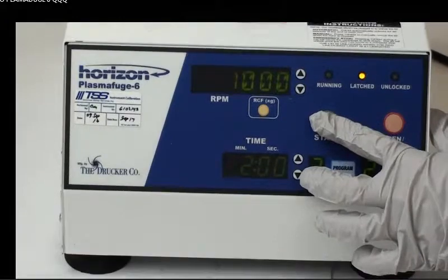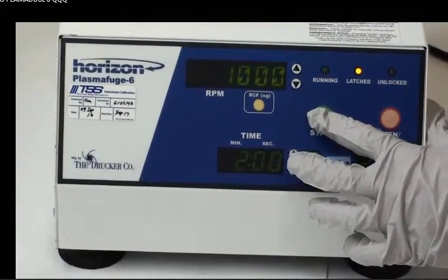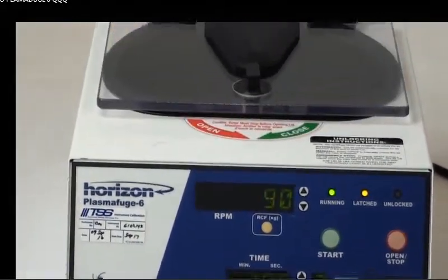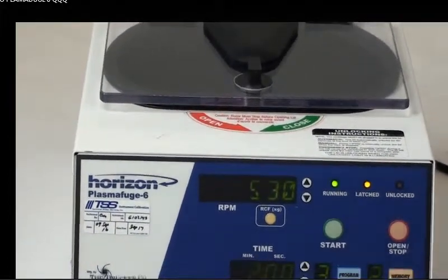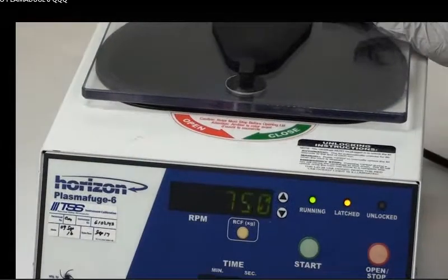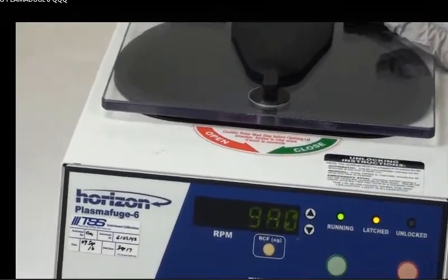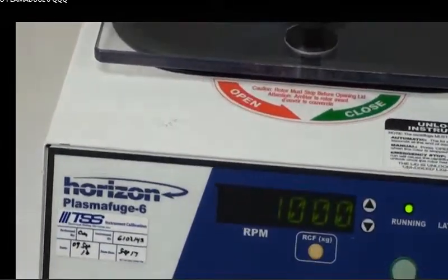You guys can see that this is in good working condition. Like I mentioned earlier, we do have a lot in stock.